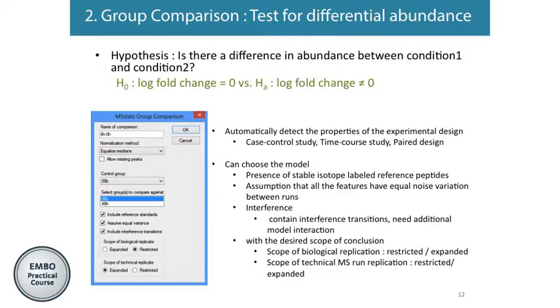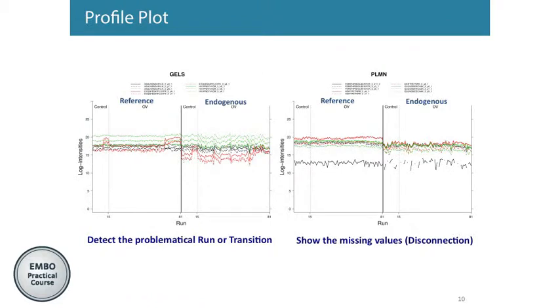The first one, assume equal variance, means, let's go back to the profile plot. Equal variance between the features means each transition. We want very equal variance. Here, the red transitions are relatively parallel, like there are really similar bounds between the runs. And here you can see the black line has a little bit more fluctuation than the red one.